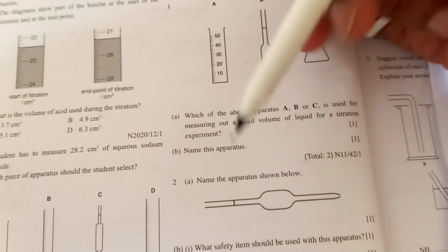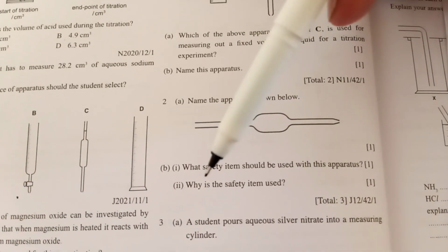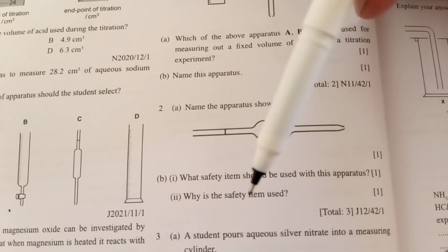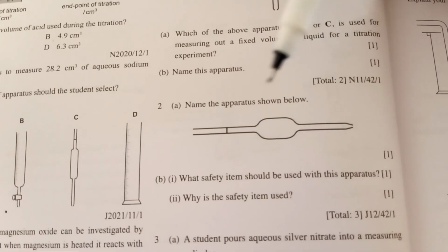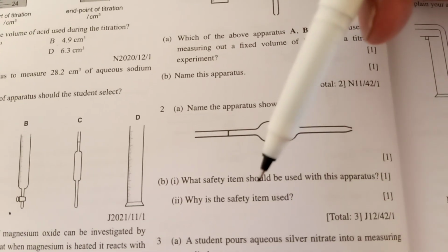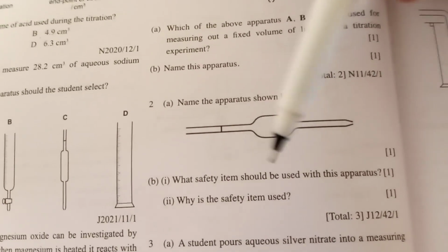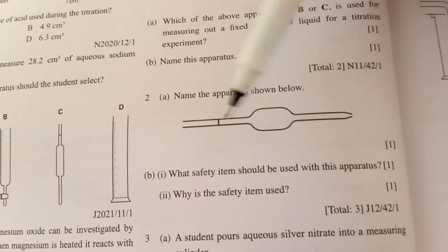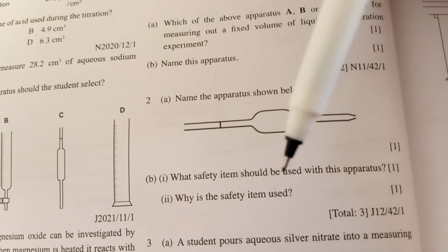Tell your teacher to show you a pipette filler. Okay, we use a pipette filler. Why is this safety item used? A pipette filler is used to prevent the solution from entering our mouth accidentally.